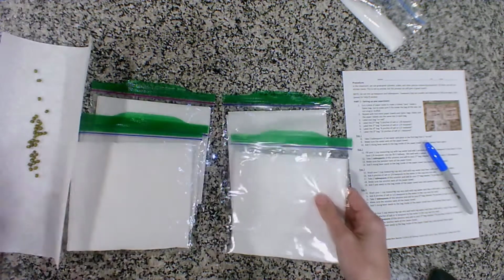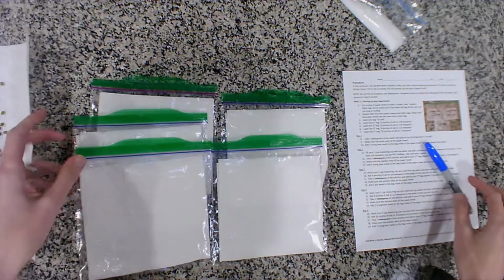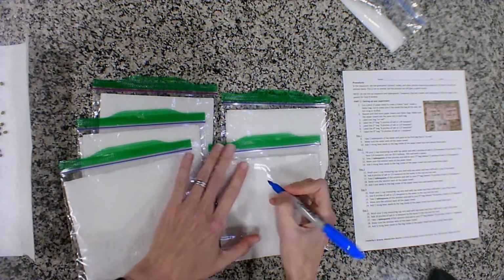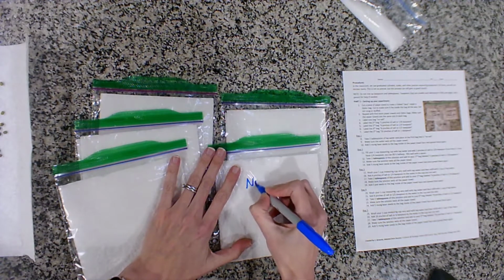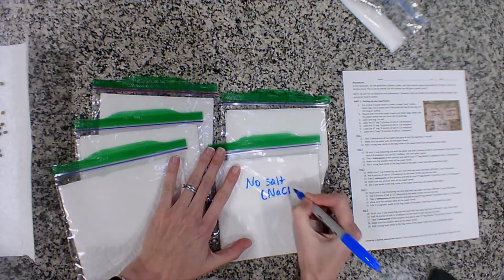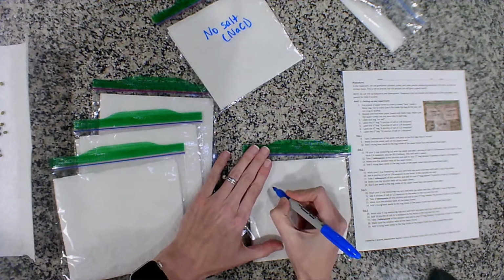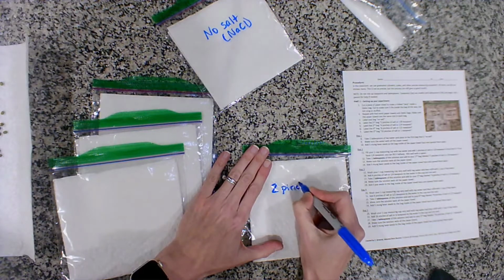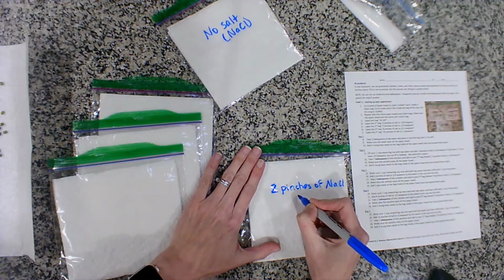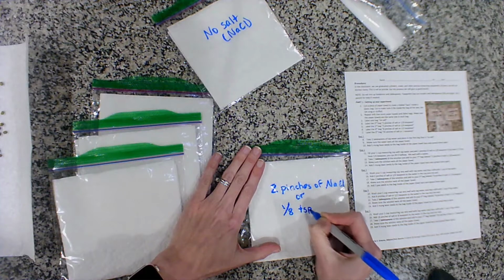Okay, so I have done all 5 bags where I have put in my folded taco paper towel inside, and now I need to go ahead and label them. So the first bag is going to be no salt. You're going to need a Sharpie. First bag is no salt. Bag 2 is going to be 2 pinches of NaCl, or 1/8 of a teaspoon, and that's little tsp.